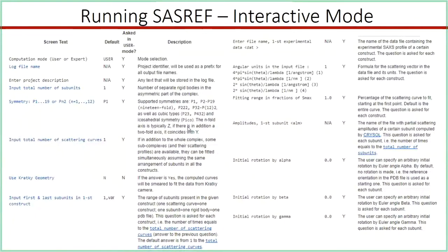So you can combine scattering information in this. The interactive mode is pretty simple. There is also a PyMOL plugin, so that is even more interactive. I have never used it, but if anyone has experience with it, they're free to chime in and tell us about their experience. There is a PyMOL plugin where you can actually look at the changes happening.